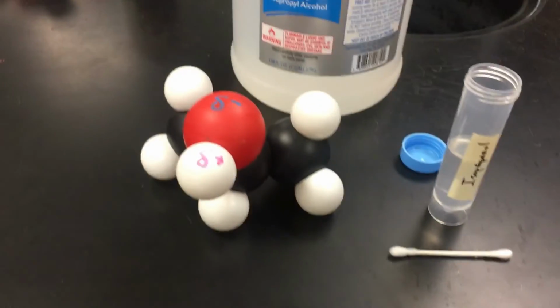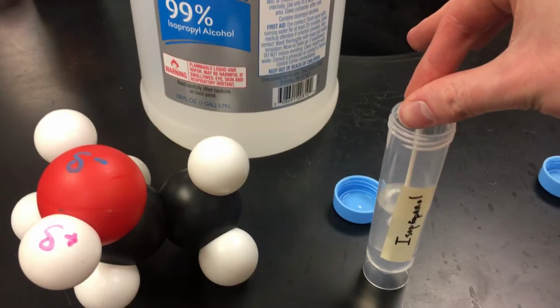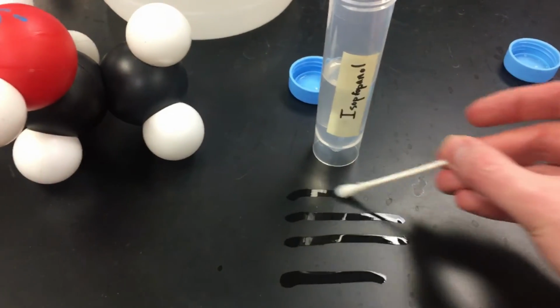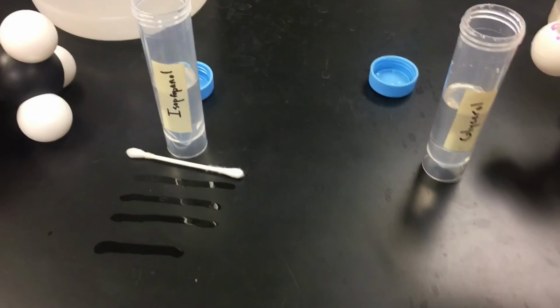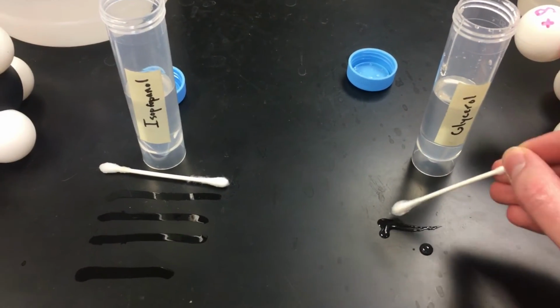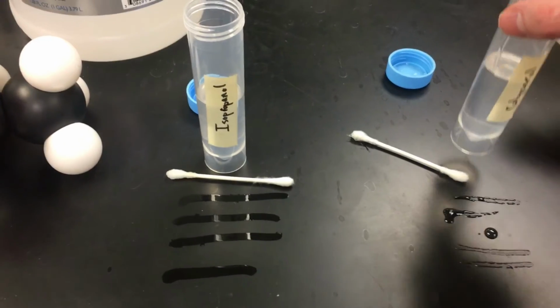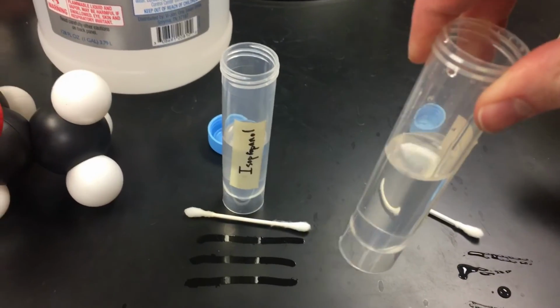So let's test these guys out. So this is my isopropanol. Streak some of that out on the table. Get some of my glycerol here. Ooh, and you can already see this is very oily. So like the ethylene glycol, you can expect this to be pretty viscous due to its strong intermolecular forces.